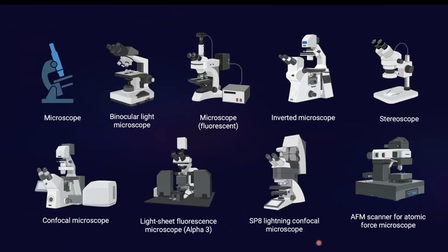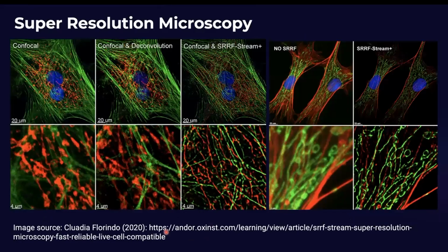They can overcome Abbe's diffraction limit slightly using different techniques, such as in this case, super resolution microscopy, where today we can see various parts of the cell. We can look at the cytoskeleton by a clever combination of labeling the cells using specific dyes and image processing.